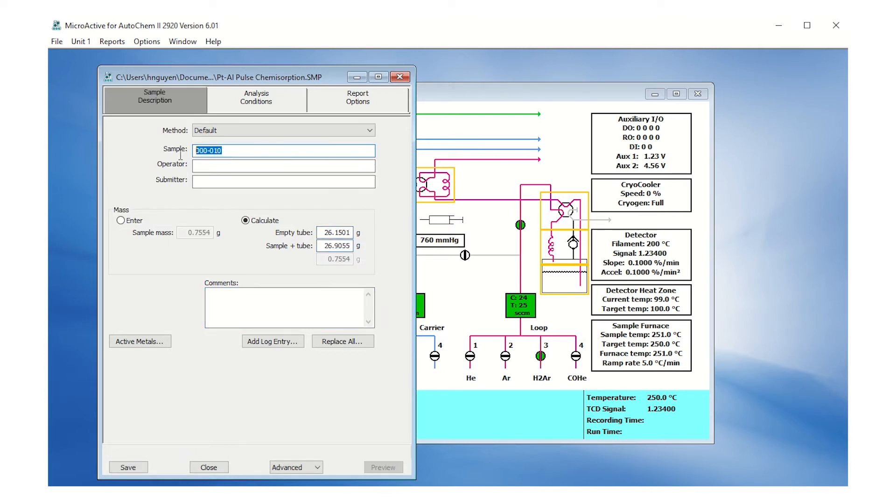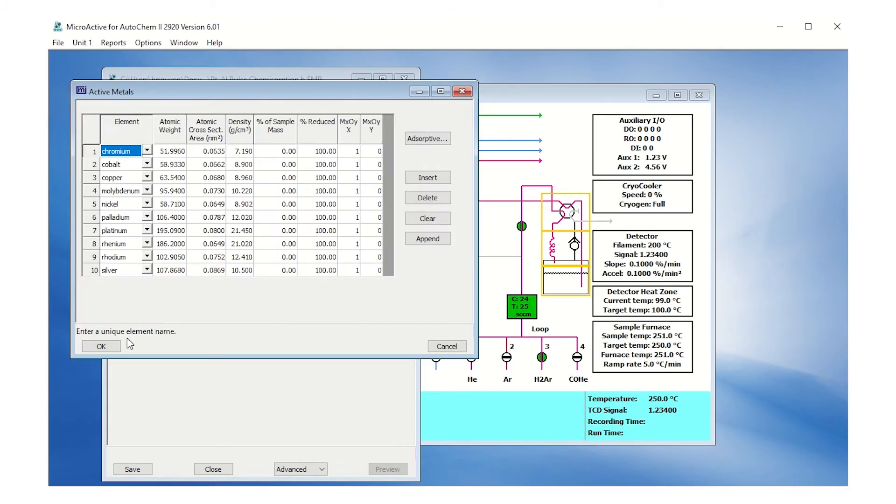Under the sample description tab, fill in the sample and operator ID. Click on the active metals tab. Under the platinum row, change the percentage of sample mass.